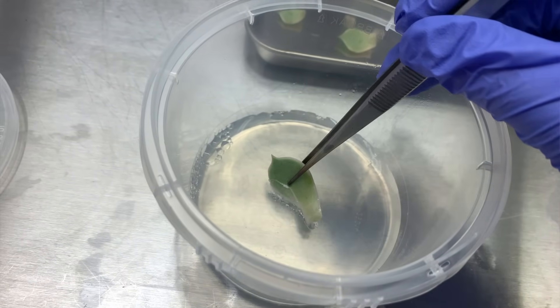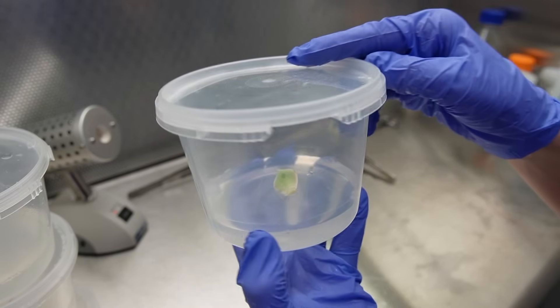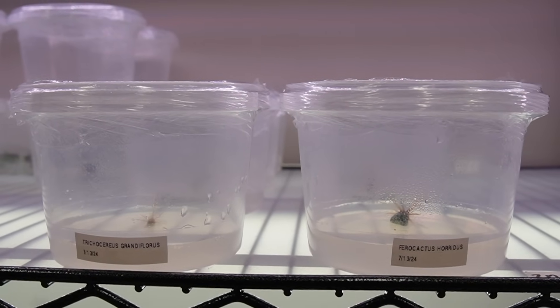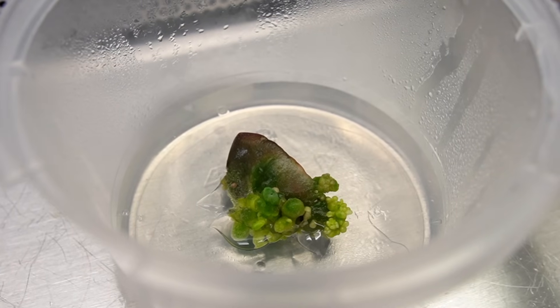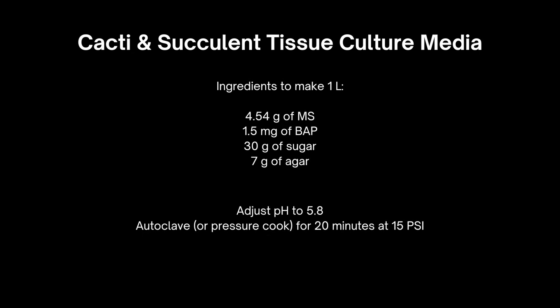When it comes to placing these plants in the media, you want the explants to make good contact with the media without necessarily submerging the plants at all. Once I have my containers of plants, I seal them with plastic wrap and place them under my grow lights — the Nurser 3 lights from Horty Power, which I would recommend. As far as next steps, you can treat cacti and succulents in tissue culture the same way you would treat any other plant. I typically subculture them — moving them from one container of media to a new one — every four to six weeks, using the same multiplication media recipe shown at the beginning of the video.